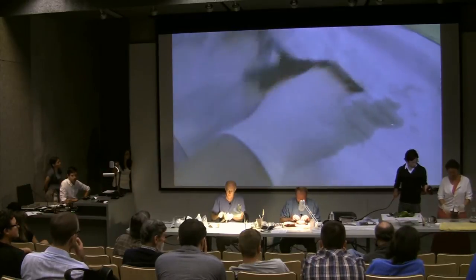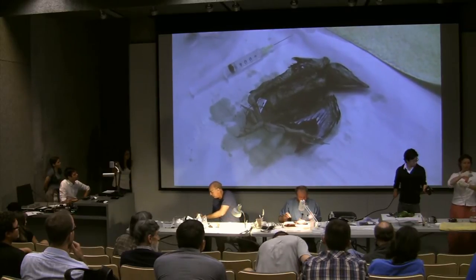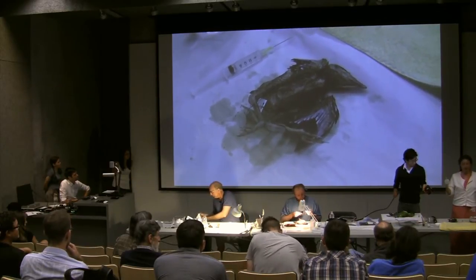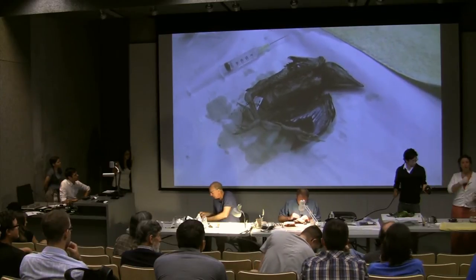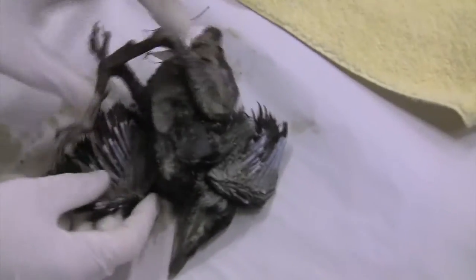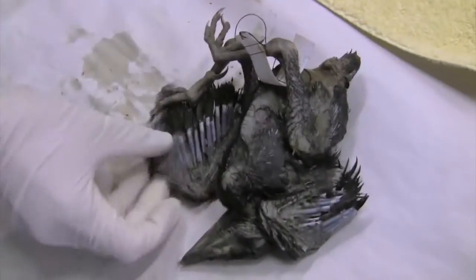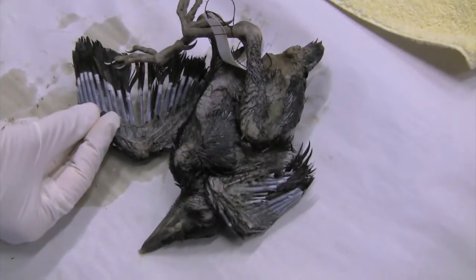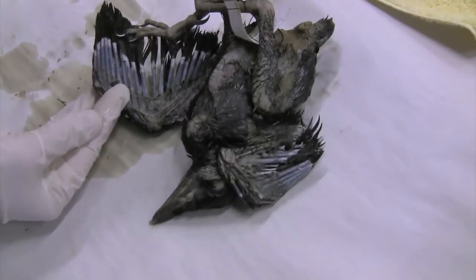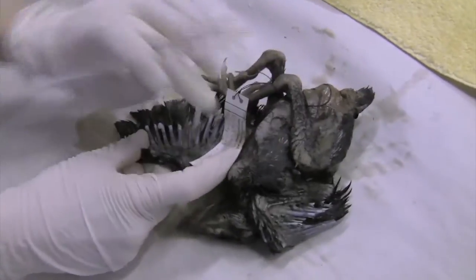The actual preparation is the nine-point injection. The nine points are left and right forelimb, left and right hind limb, left and right pectoral, two in the gut, and then don't forget the head. You're just going to use a syringe and a needle. Always teach your students to poke away from themselves. I've found it's a great habit to hold onto the limb, put the torso of the bird away from you, and push into the bird with the tip of your needle.